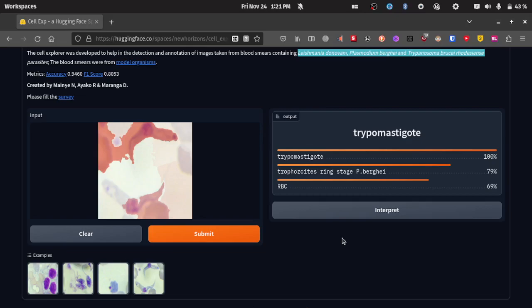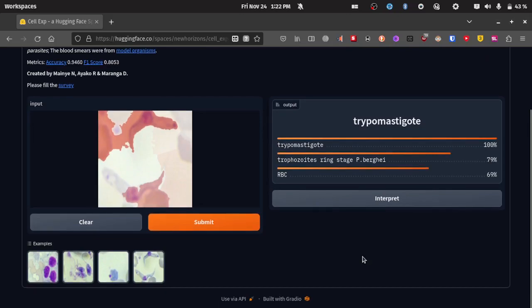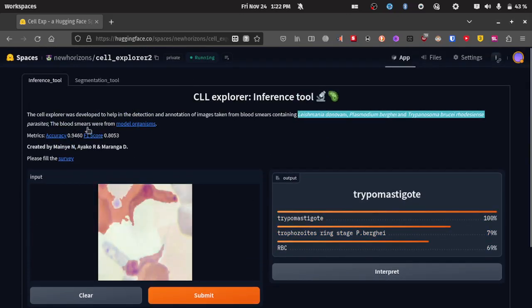Here we are seeing the parts that were used to make the prediction. You as the investigator would probably say just here, but the model identified this part and this other part, the parts labeled in orange, and those are places that were used to make the prediction. And that's the first part of the application.